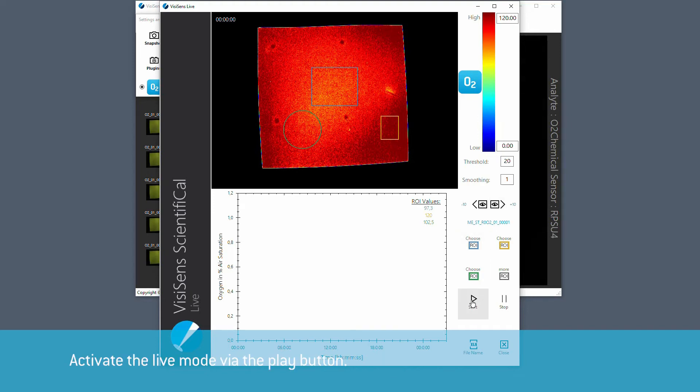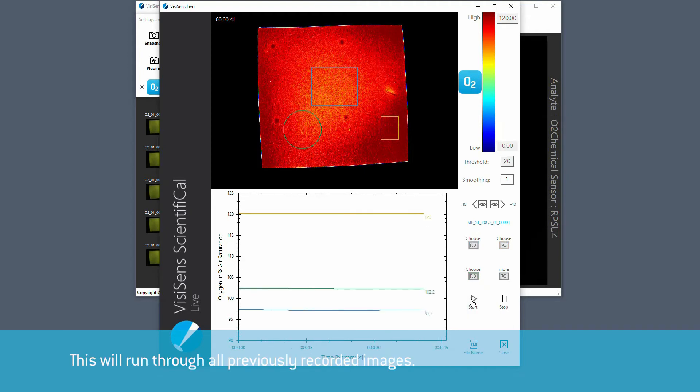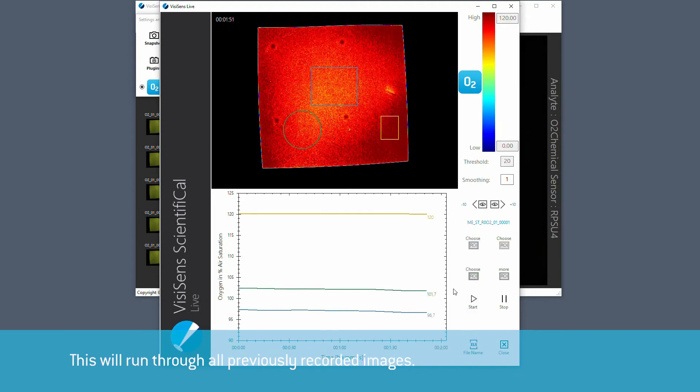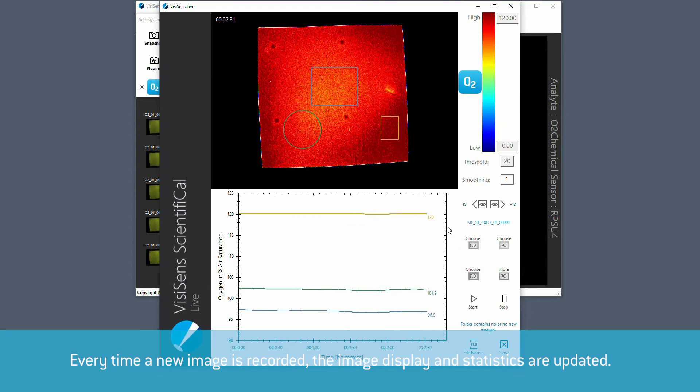Activate the live mode via the play button. This will run through all previously recorded images and every time a new image is recorded, the image display and statistics are updated.